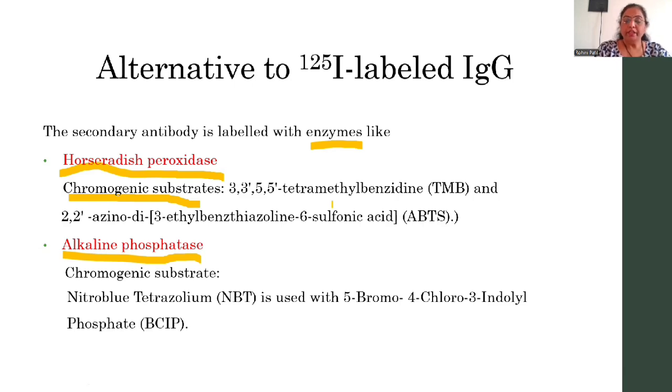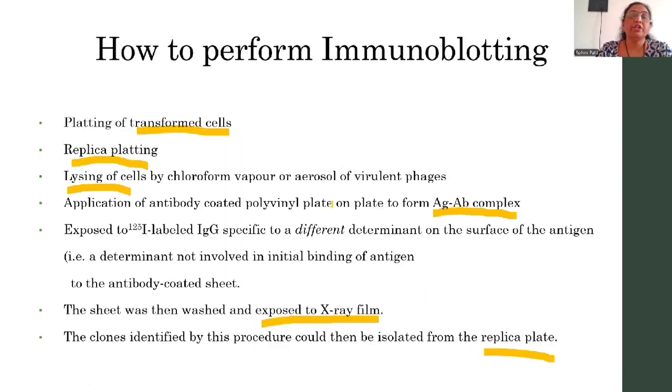Now here, instead of the plasmid, there is the use of lambda based vectors. And instead of plasmid vectors in E. coli cells, there is a use of lambda based vectors for the cDNA library construction. And the lambda vector which is used is lambda gt11.